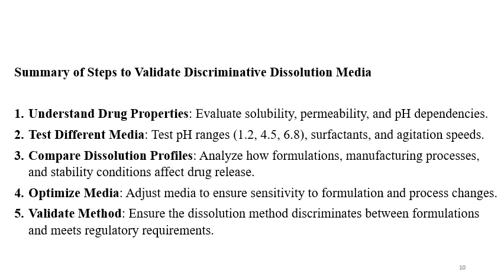Understanding drug properties for evaluating the solubility, permeability, and pH dependencies. Test different medias like media with the pH range of 1.2, 4.5, or 6.8, with or without surfactant, and with different agitation speeds and the media volumes. Compare dissolution profiles, analyze how formulations, manufacturing processes, and stability conditions affect the drug release.